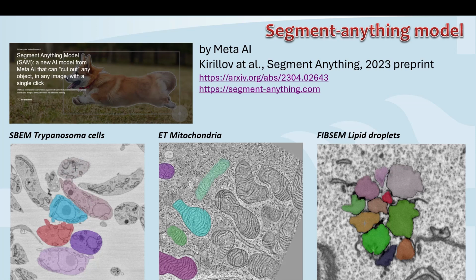So in each of these cases, basically the whole organelle can be selected with a single mouse click, but if it doesn't really work, then you can use the control. For example, here you can see that control click removes material which should not belong to an object.